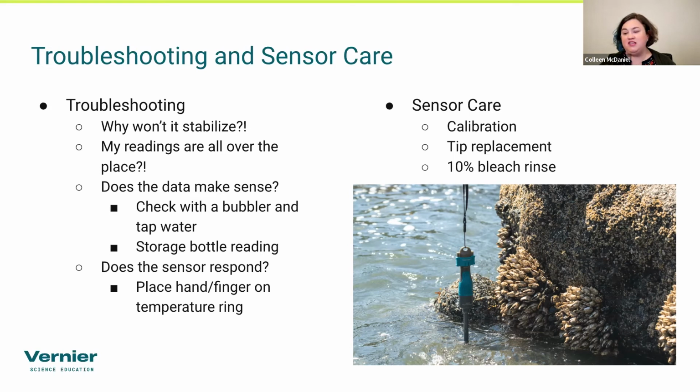We found it very specific to wavelengths of light and the position of the light. The light actually has to be shining directly on the tip of the probe. The Go Direct probes were redesigned a little bit to avoid that problem, so we have not seen that problem with the Go Direct versions.